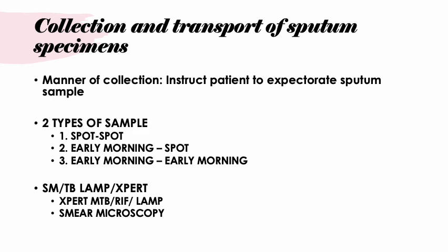In other methods, we use smear microscopy. This is the commonly used method using the AFB staining procedure.